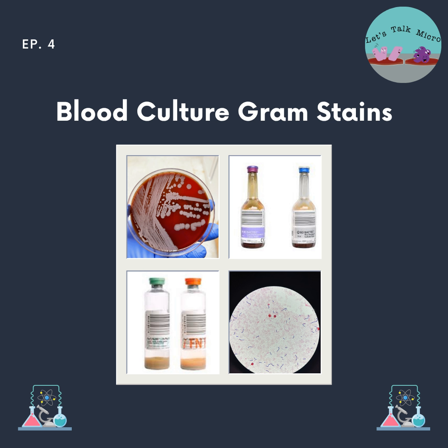We went over the objectives, right? We used 10x, 50x, depending on the microscope. We use 100x, 40x, you reserve it for like wet preps and KOH. But your main objectives are 10x to focus and then 100x to see what you are trying to find so you can see it better. So higher magnification is an oil immersion objective. So we went over that. So by now you are microscope experts.